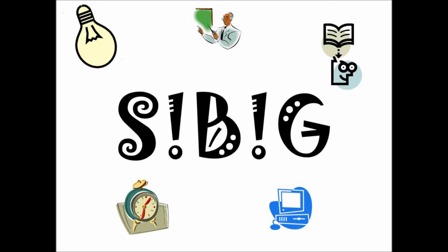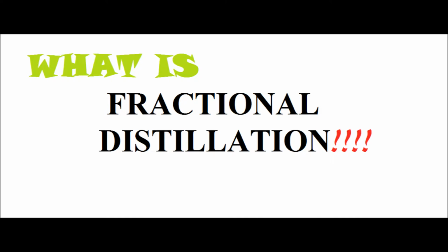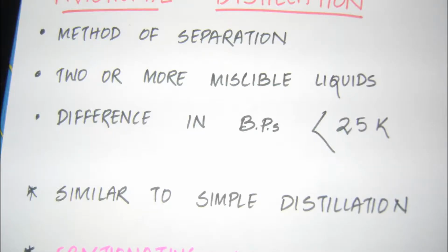Now in this video we are going to learn about a new type of distillation which is known as fractional distillation. We will know what fractional distillation is and how it is done to separate different organic liquids. Fractional distillation is used for the separation of two or more miscible liquids for which the difference in boiling points is less than 25 Kelvin.